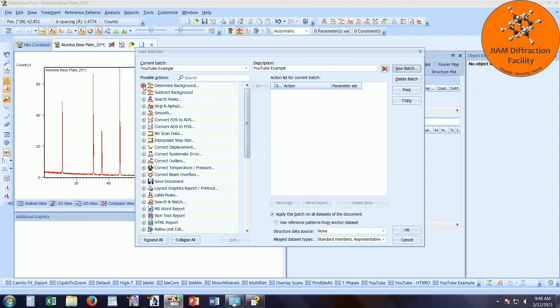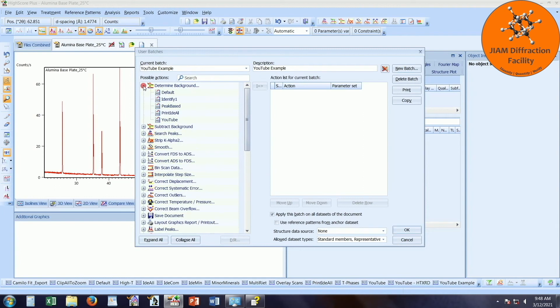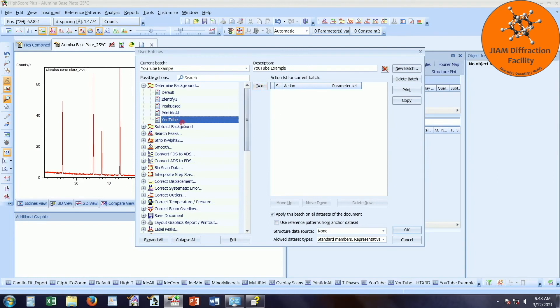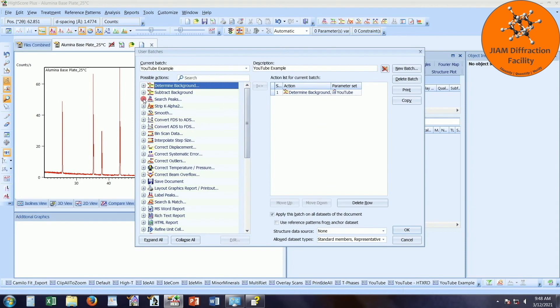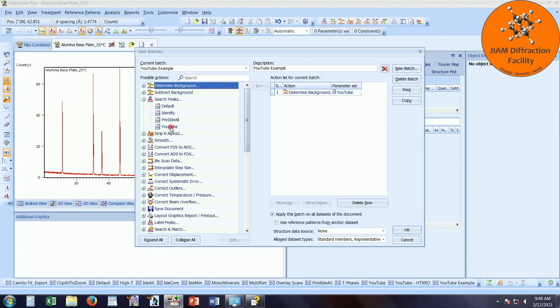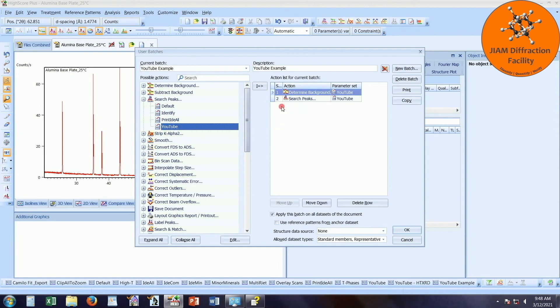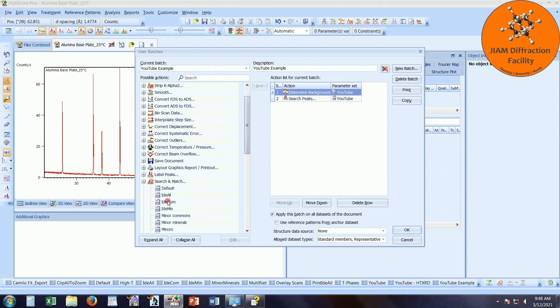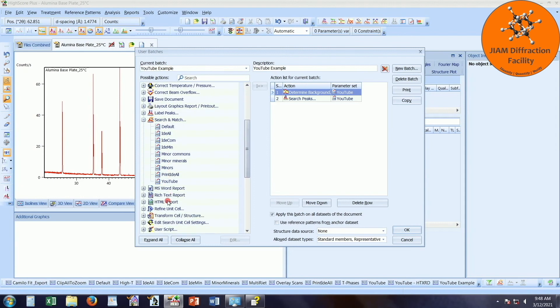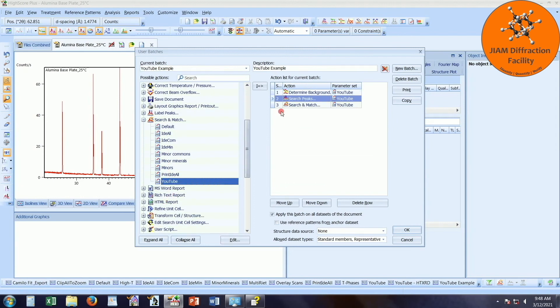So the first thing we will do is left click next to background. And here we see that I have got that YouTube parameter set. I can either click this button or left click and drag it over. Next I want to search peaks. Here's my YouTube parameter set again. So I will drag that over. And then I want to search match. Right there. Scroll down. Left click. And drag my search match over.